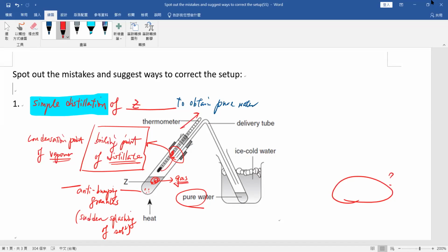We will call that the solution is superheated, right? Finally, all of a sudden they find some rough surface in order to form gas bubbles. If the solution contains too much heat while it still cannot vaporize, it will store the energy, and all of a sudden release it and form very large bubbles. During that action, there is a sudden splashing of the solution. So we call that bumping.